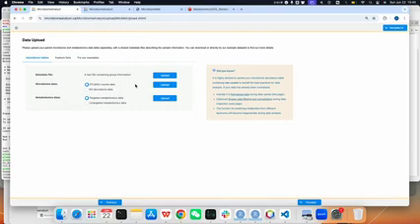The samples should be the same in the microbiome data and the metabolomics data. So make sure when you do the raw data processing, the names of the raw files generated from the machine may be different, but when you upload here, you need to make the sample names consistent across the different tables. So we can see here we need three types of data.